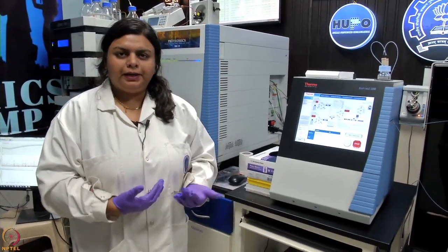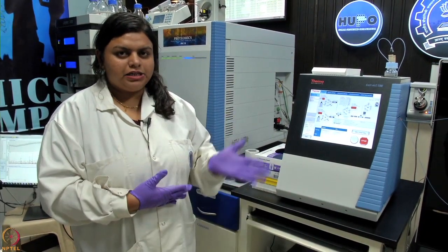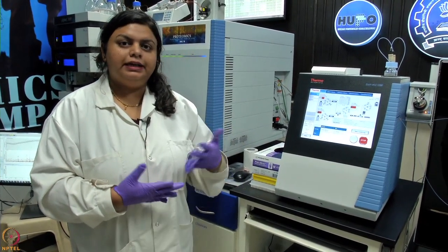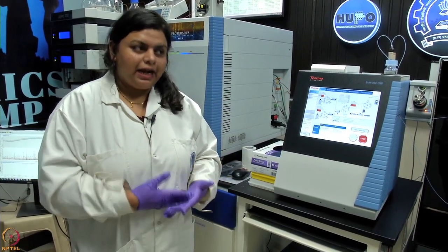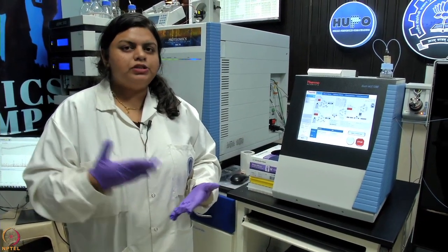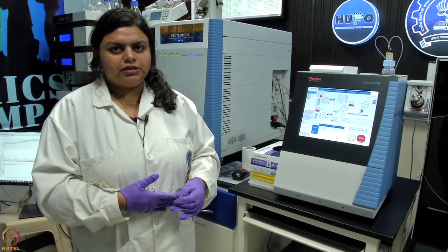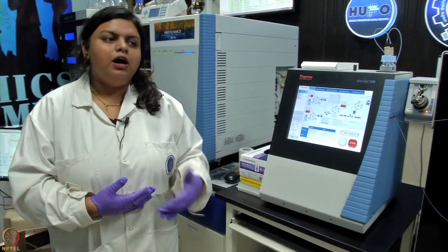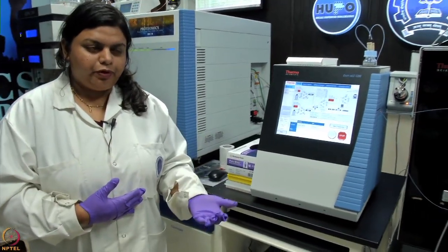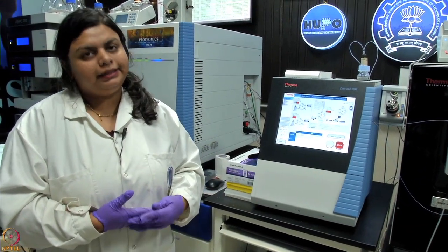The advantage of coupling a very traditional method like immunoprecipitation with something advanced like mass spectrometry is that you get the best of both worlds. While antibody-based detection can detect even a very low abundant protein, mass spec can help you identify that protein as well as several other proteins which are potentially the interacting partners of the protein of interest. Therefore, IPMS is a very promising approach to look into mechanistic details of how a cell performs, how a signaling cascade performs, and hence it is emerging as a very prominent tool in interactomic studies.